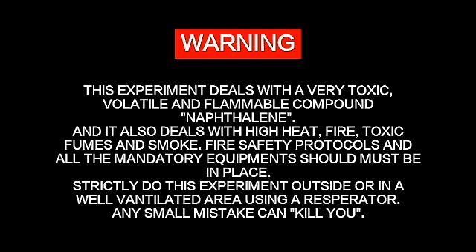Warning: this experiment deals with a very toxic, volatile and flammable compound, naphthalene, and it also deals with high heat, fire, and toxic fumes and smoke. Fire safety protocols and all the mandatory safety equipment must be in place. Strictly do this experiment outside in a well-ventilated area using a respirator. Any small mistake can kill you.